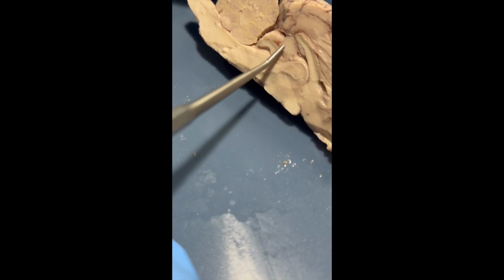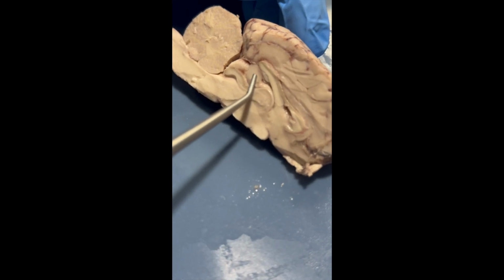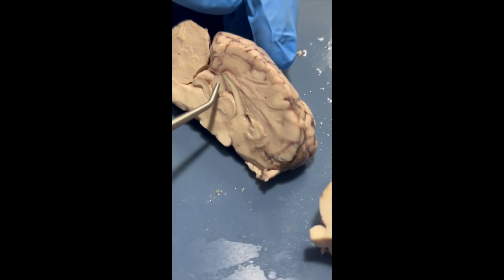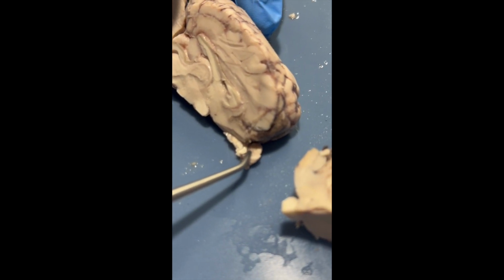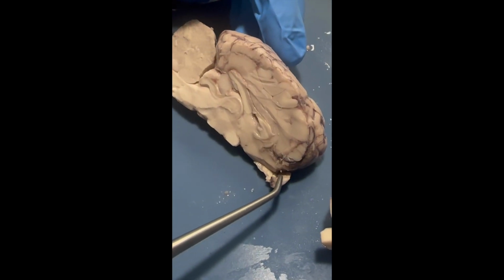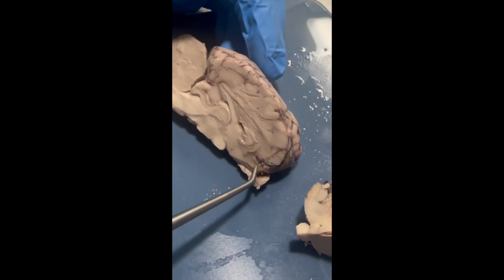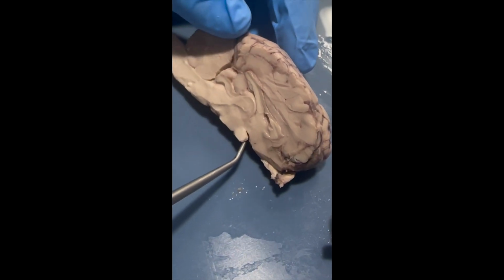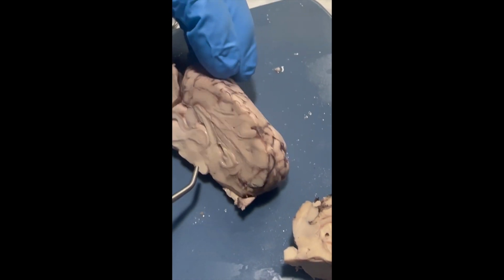The pineal body can be seen right here. It is a gland that secretes melatonin. Melatonin is what our body uses to regulate our sleep cycles. Moving from the pineal gland, we can go to the olfactory bulb, which is right here. The olfactory bulb is used to process smelling. And then below that, the optic chiasma, which is the crossing point of the optic nerve. The optic nerve can be seen here. It's this white structure here, and its crossing point would be right directly here.